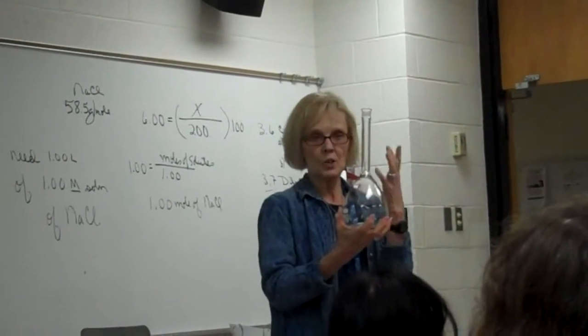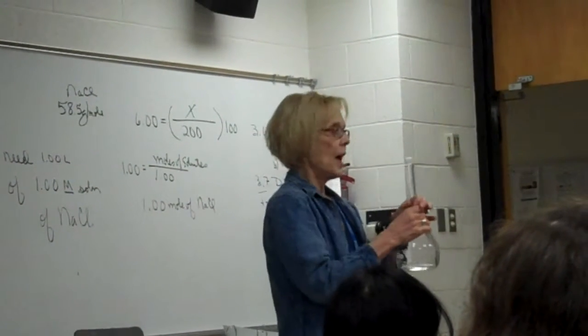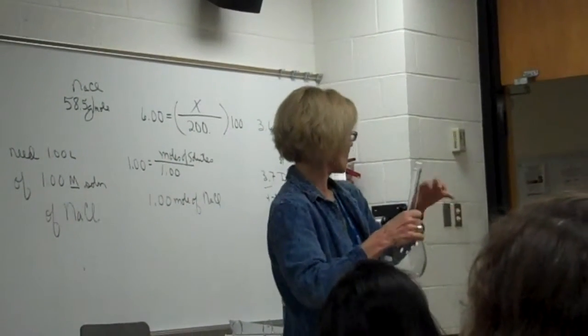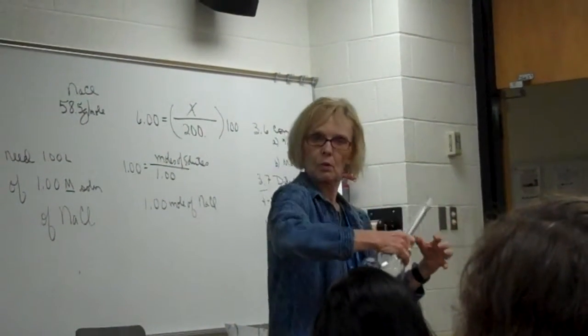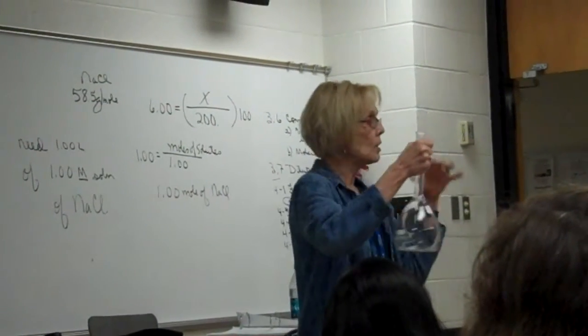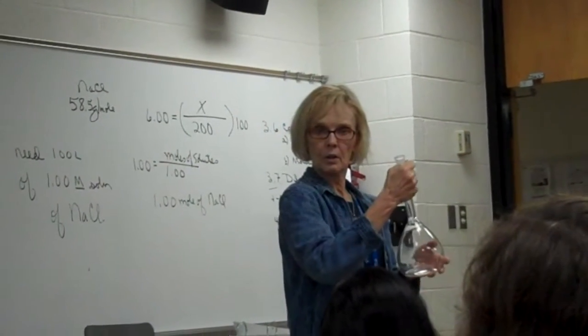Because if you just start dumping water in before it has a chance to all dissolve, you may run past the line when it dissolves, because sometimes with the dissolving process it shrinks or expands. So you want to be conservative. So a little water, then put your salt, stir it a whole bunch, top it off with distilled water.